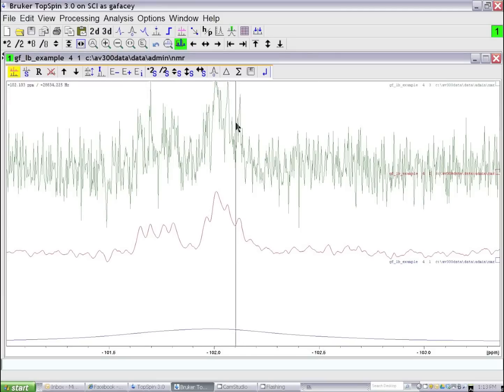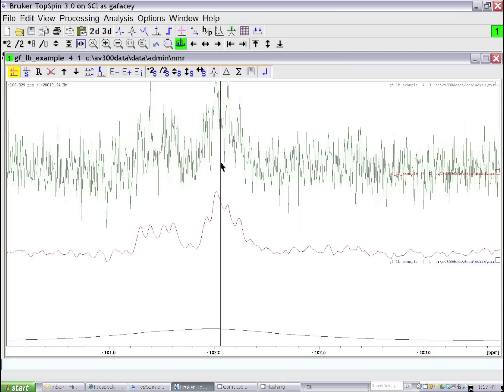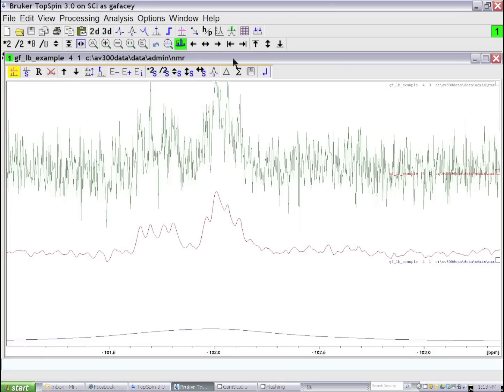So I hope this helps you decide on which line broadening parameters to use for your NMR spectrum to improve the quality of your data.